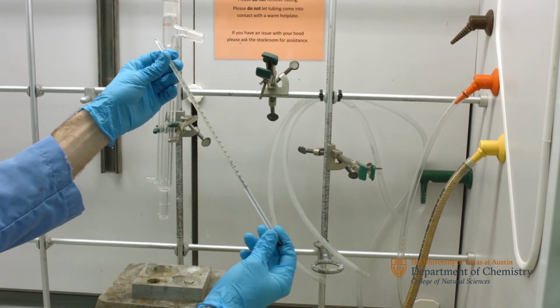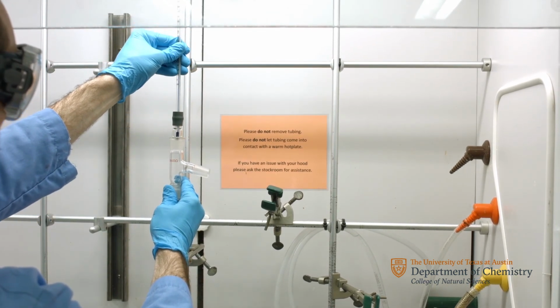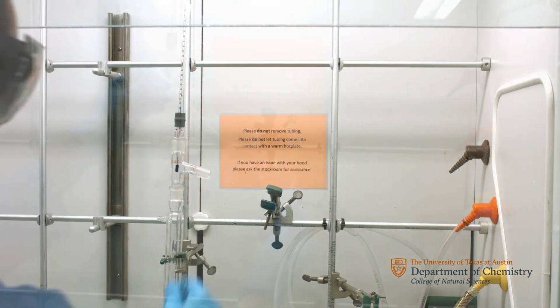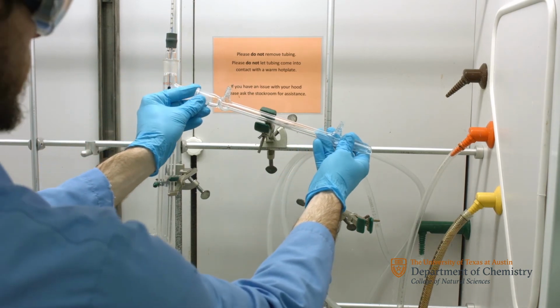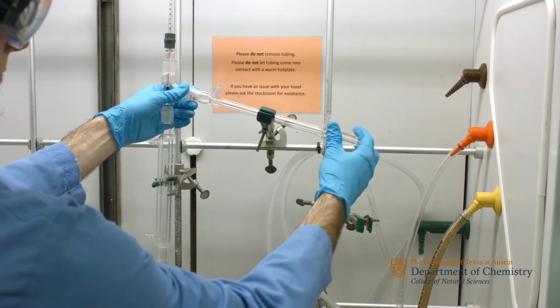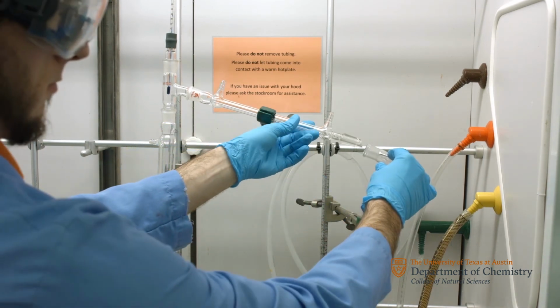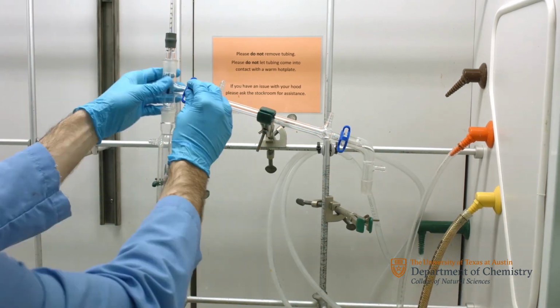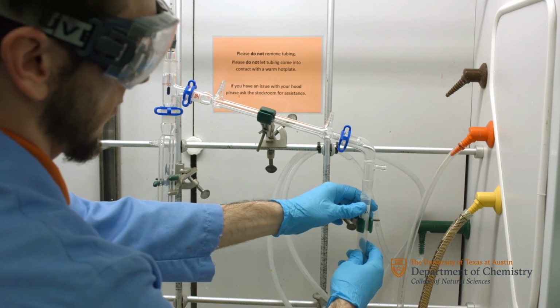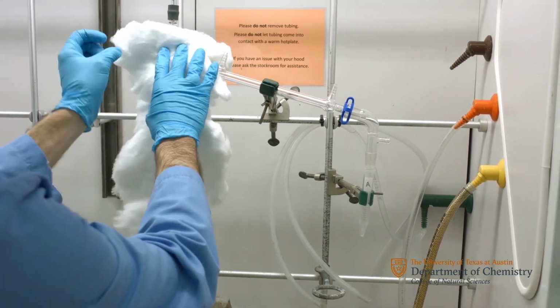Now insert the thermometer to the appropriate position. Now, attach the condenser to the distillation head with the glass outlets facing up. Connect the vacuum adapter and then attach the keck clamps to the appropriate glass joints. Clamp the centrifuge tube labeled A under the vacuum adapter. Next, loosely wrap the column and distillation head with cotton and then aluminum foil.